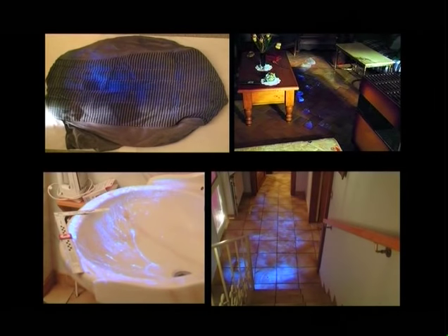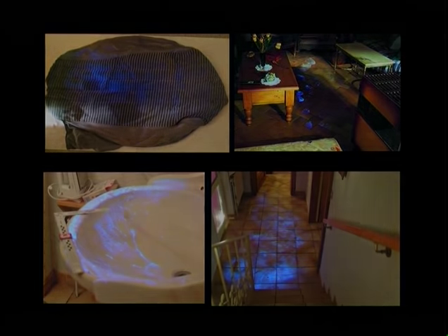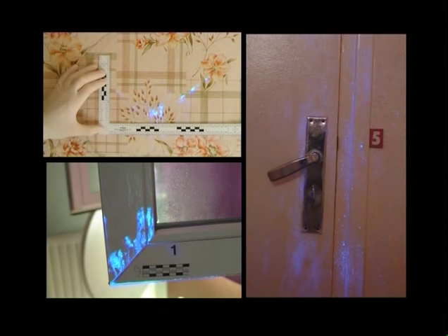Then as regards photographic techniques, we can add that you must always remember that we will do morphoanalysis afterwards. So the shot must follow the shape of the zone and should not create any lines of perspective. You notice that when we were handling a vertical zone, we put the camera at a 90 degrees angle facing the zone that we were photographing. You should avoid any view of the zone from above.